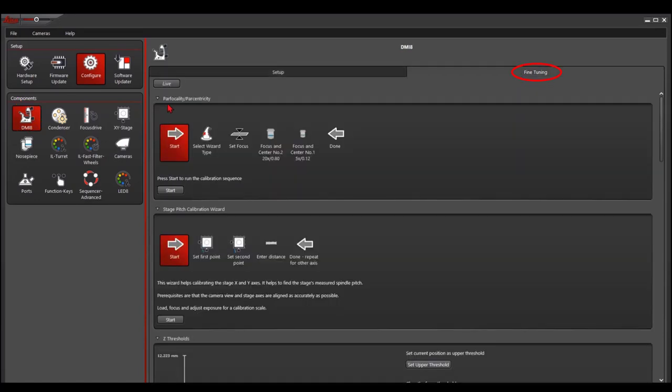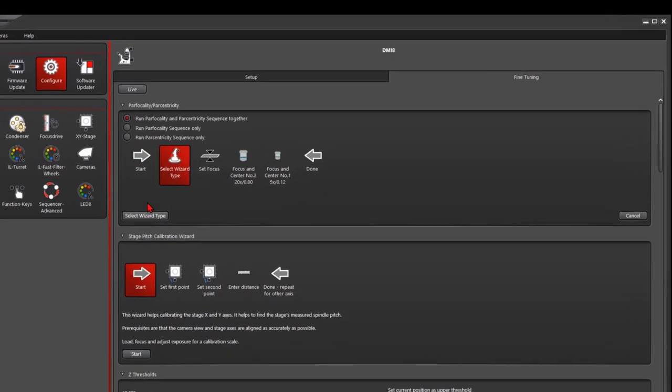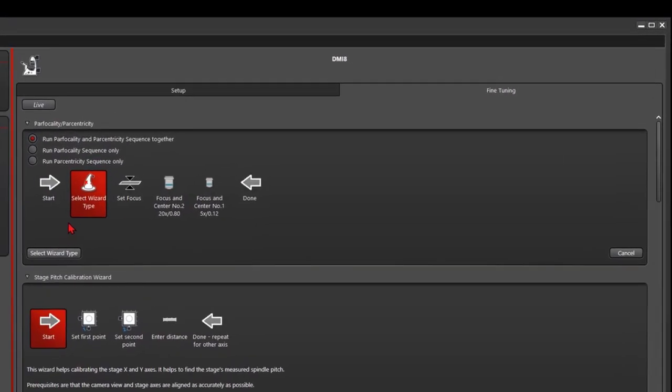The first one is called pathfocality and pathcentricity. We click start. In this case, there are three options for you to choose.